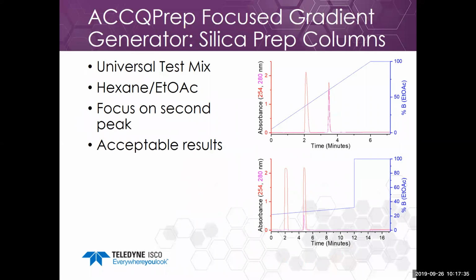It actually works very well on silica gel too, without any further calibration. We have a universal test mix that we use. This was run on silica prep, hexane ethyl acetate. I focused on the second peak over here, and I then ran it, and I got some very nice and acceptable results off of that.